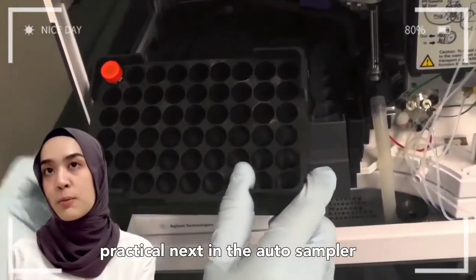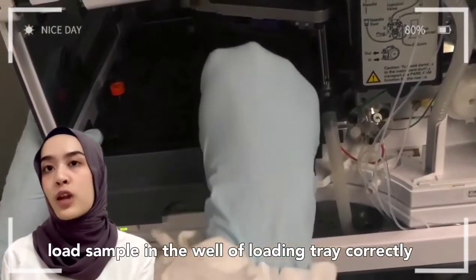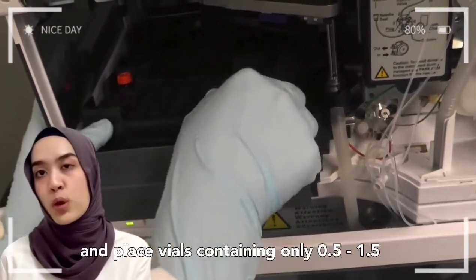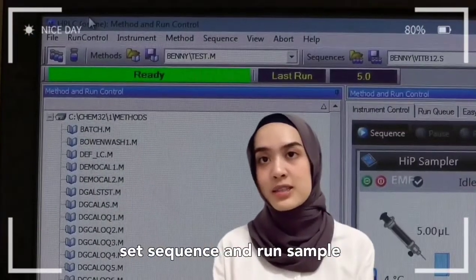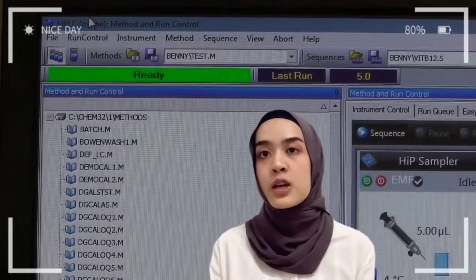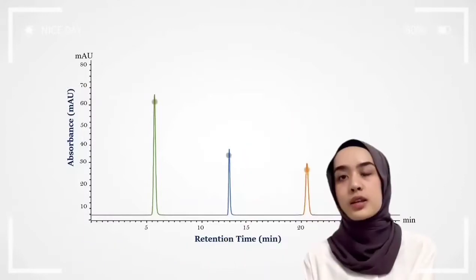Next, in the auto sampler, load the sample in the well of the loading tray correctly and place a vial containing only 0.5 to 1.5 ml of sample to obtain efficient sampling. Then, set the sequence and run the sample. The auto sampler will inject the sample automatically into the system.